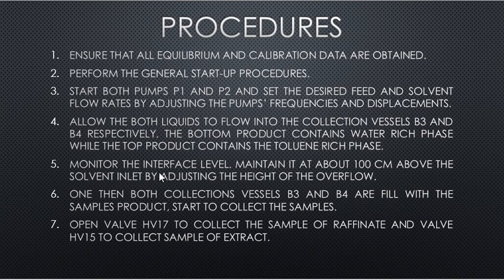After that, we have to monitor the interface level and maintain it at about 100 centimeters above the solvent inlet by adjusting the height of the overflow. Once both collection vessels B3 and B4 are filled with the sample products, we can start to collect the samples. Open valve HV17 to collect the raffinate samples, and another valve, HV15, to collect the extract samples.